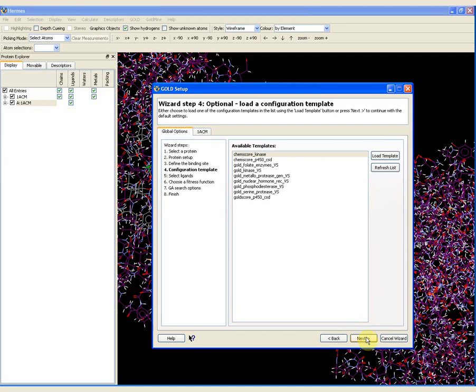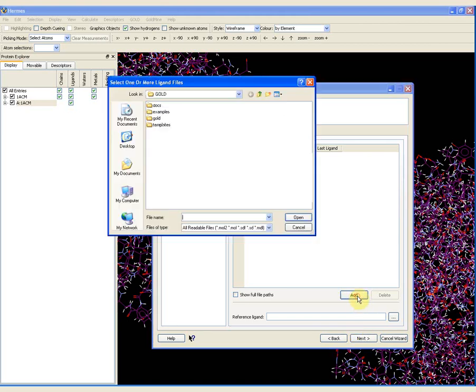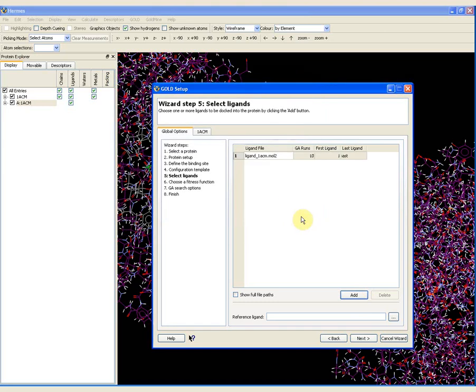I can then click next. There are some configuration templates available, but in this particular instance they are not useful, so we are not going to use any of them. I then need to select which ligand to dock. In this instance, I am going to demonstrate how to dock a ligand back into its native protein — I have extracted one of the ligands and I am going to re-dock it into the binding site. If I press add and navigate to where I have saved this ligand — saved in the gold webinar folder as ligand1acm, a Mol2 file — I open this ligand.